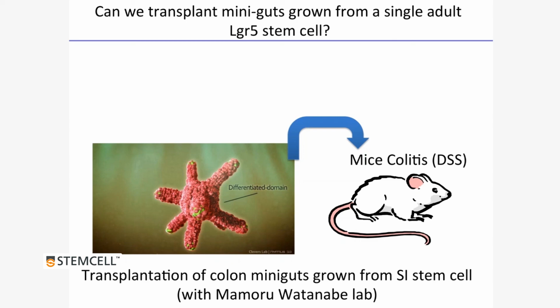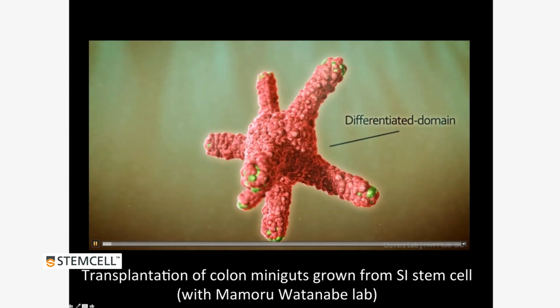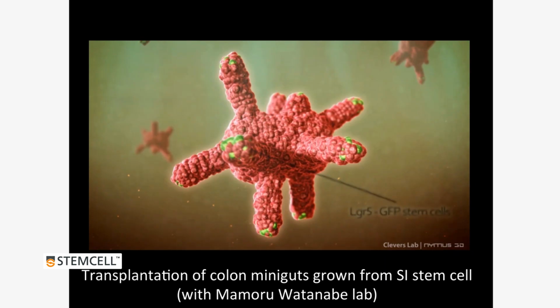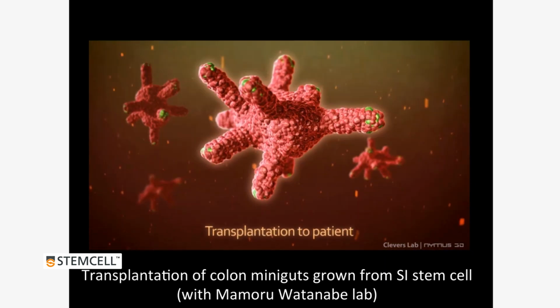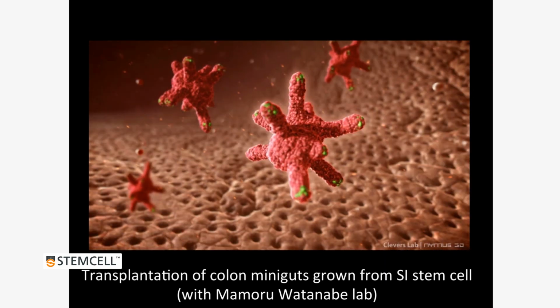The transplantation went as follows, and this is just an animation to illustrate how it worked. We collected as many intestinal organoids as possible, and via enema, these organoids were transplanted into the anus of these mice that were harboring intestinal lesions induced with DSS, which is a model for enterocolitis.